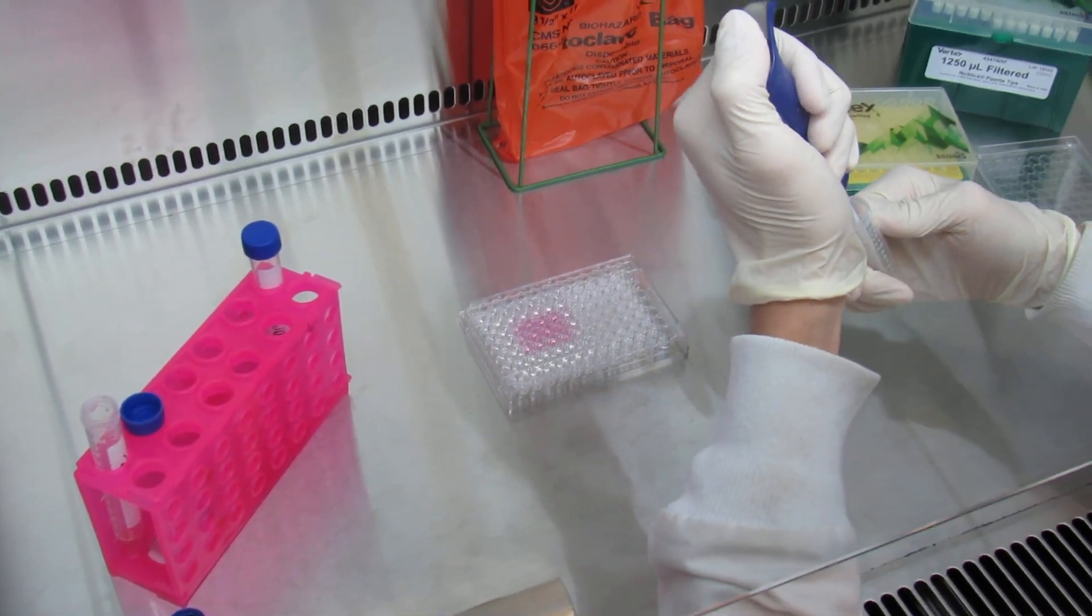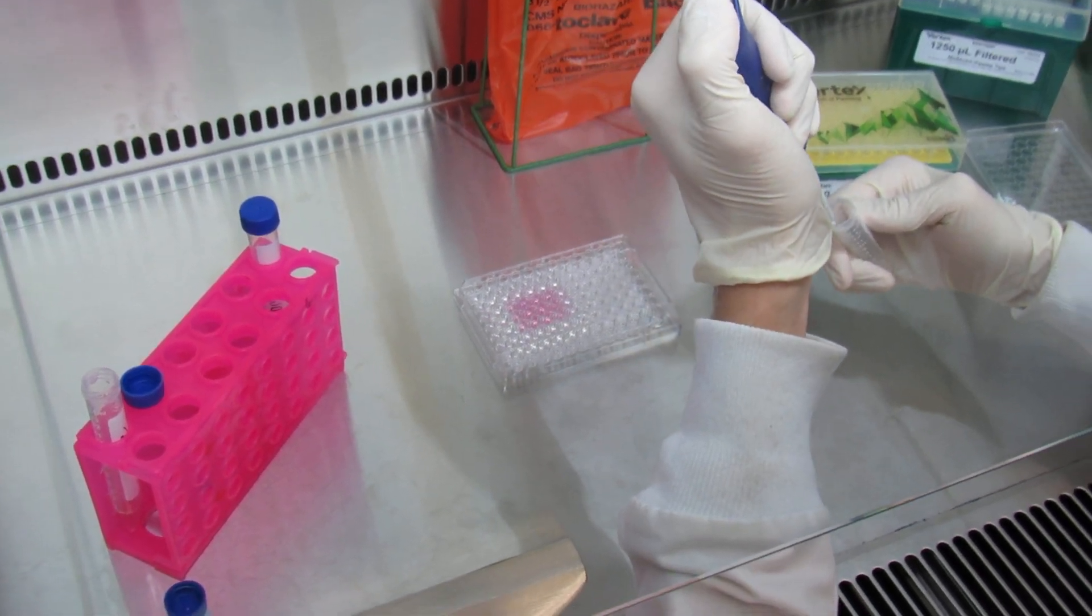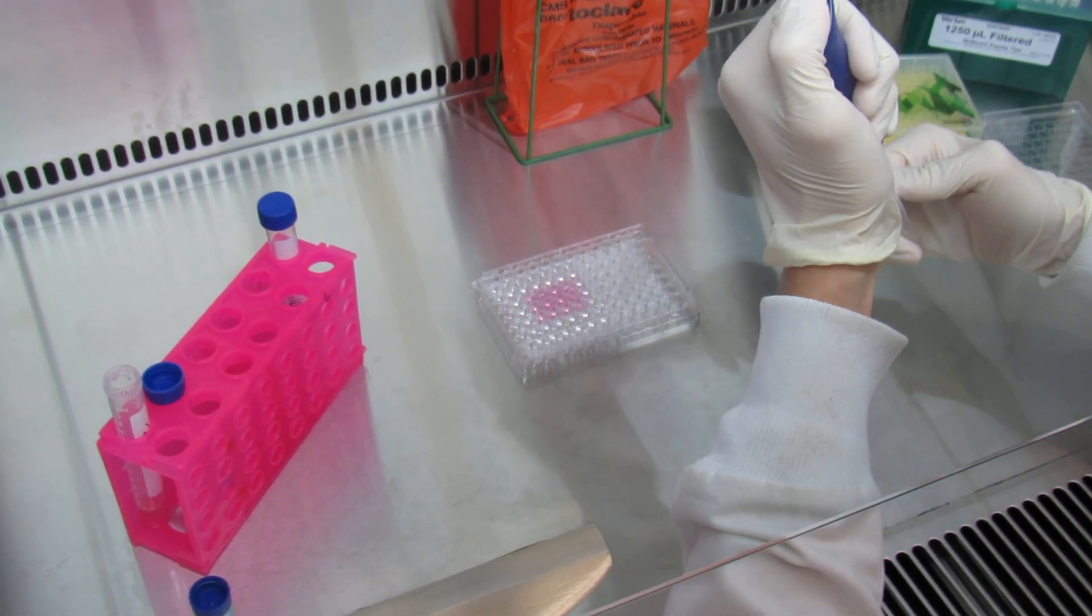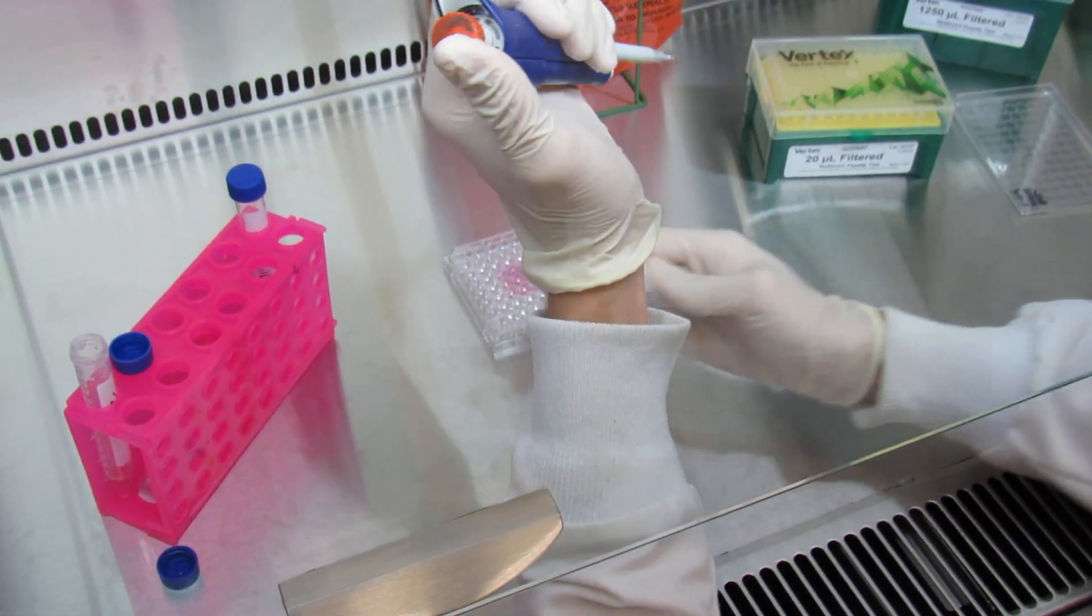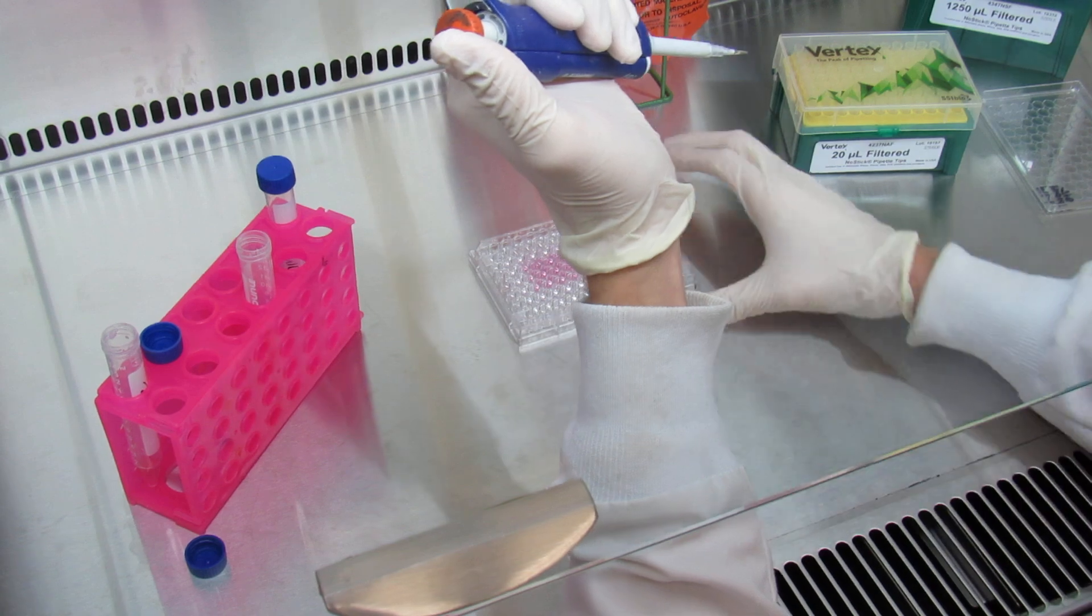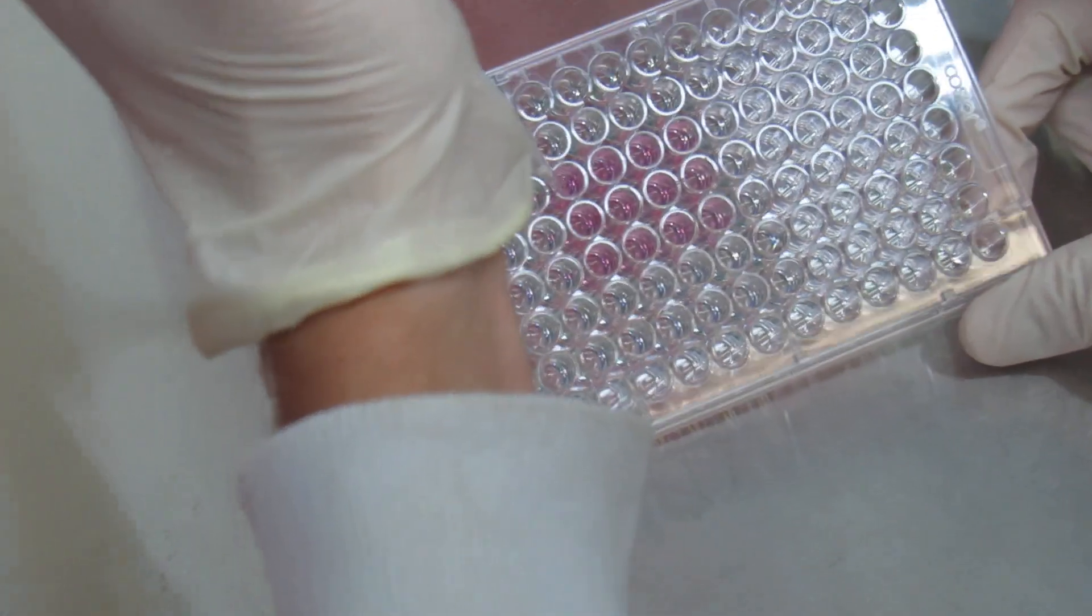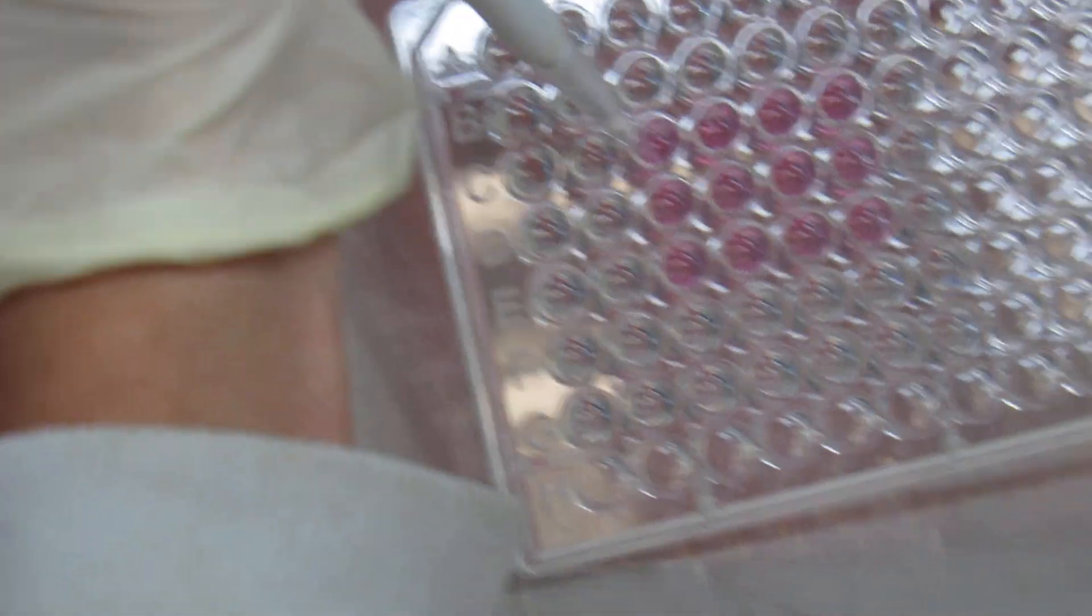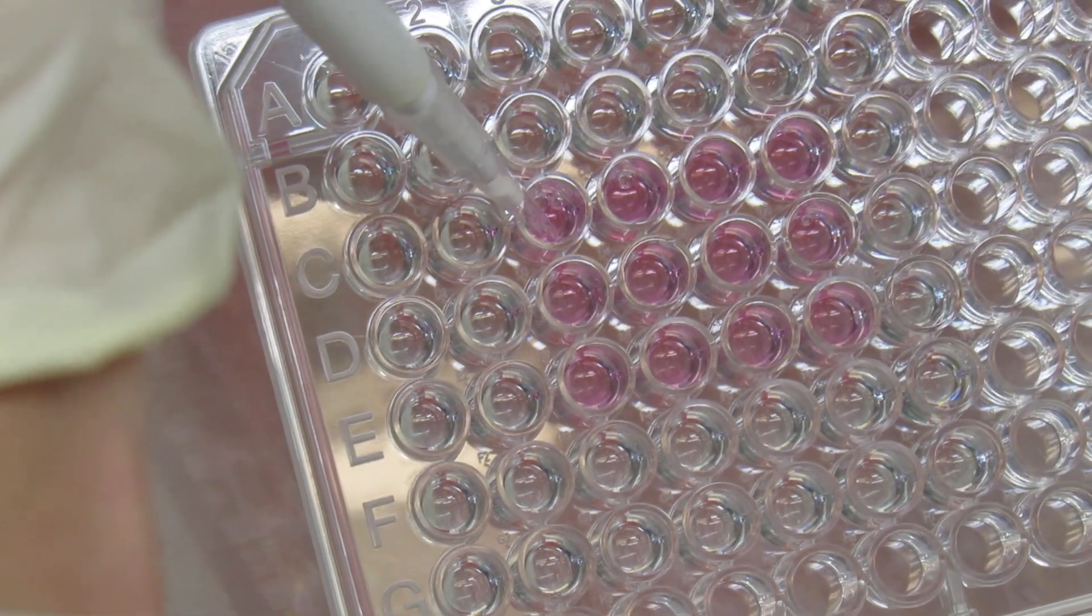You'll take 10 microliters of DMSO and you'll work with one well at a time. I'm going to add the DMSO directly into the DMEM of the first well of the first row.